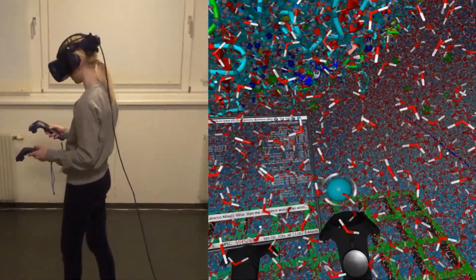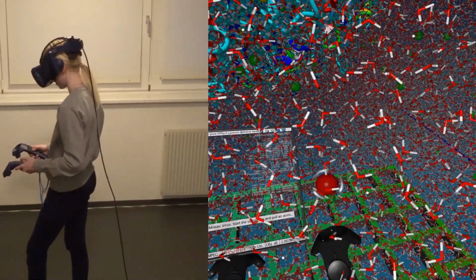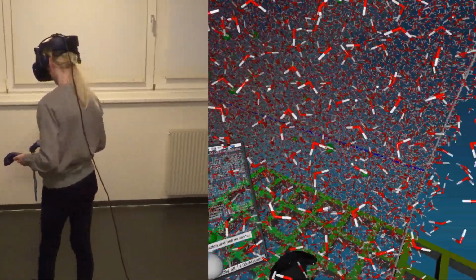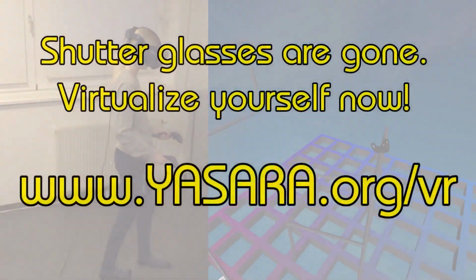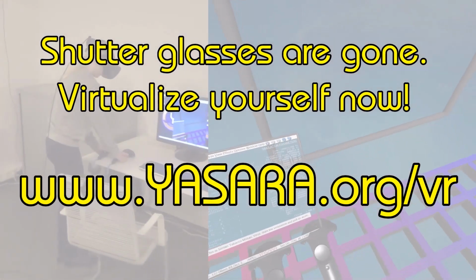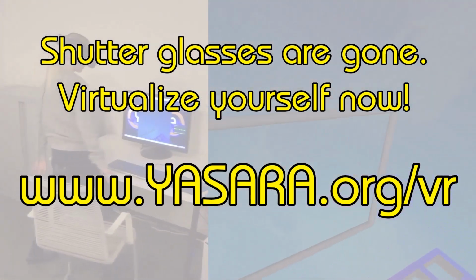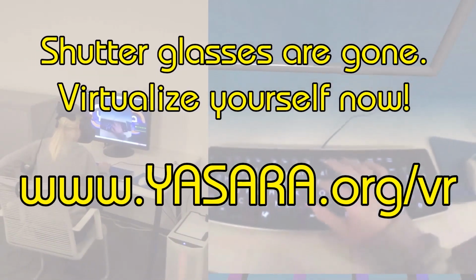By offering you the free choice between a seated and a standing workplace, YASARA combines the relaxed and productive 3D modeling experience known from shutter glasses with the exciting possibility to walk through and touch your models. Try it yourself at www.yasara.org/VR.